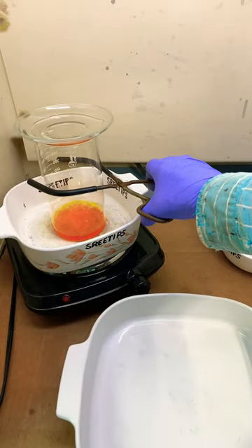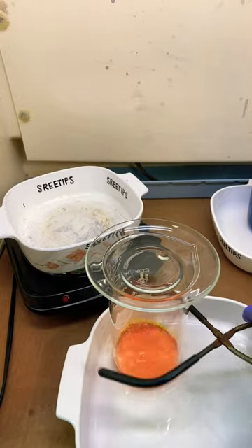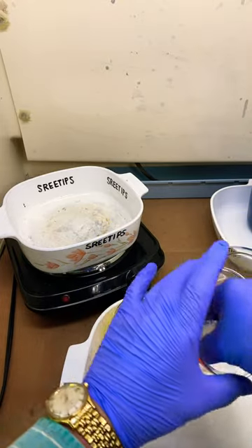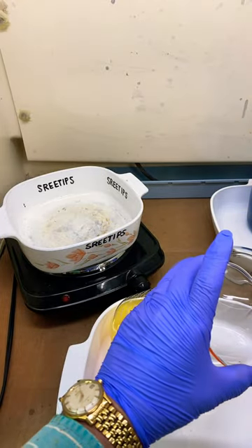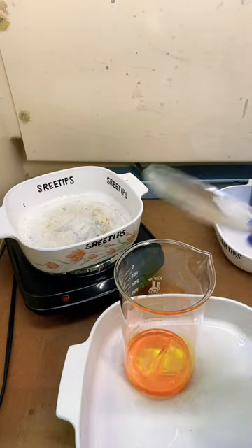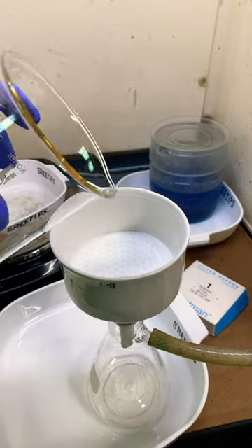I've got all the pure gold dissolved now. I'm going to pull this down off the heat. I'm adding a couple of ice cubes to cool our solution off. Now let's filter the gold solution.